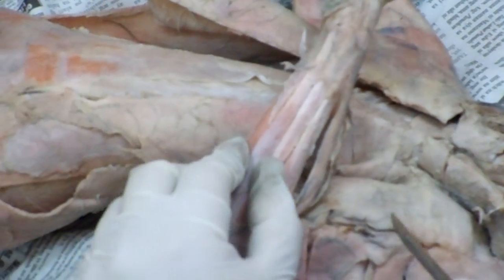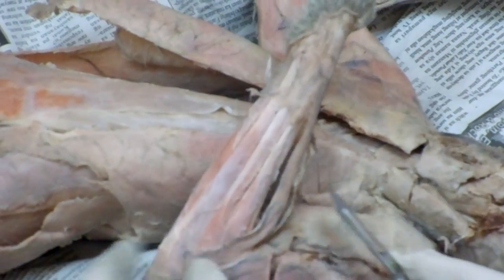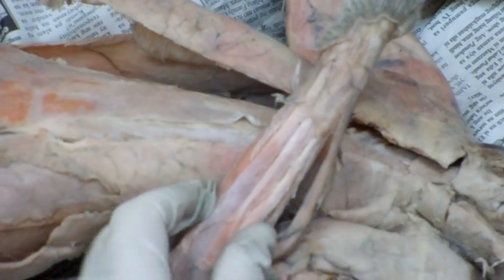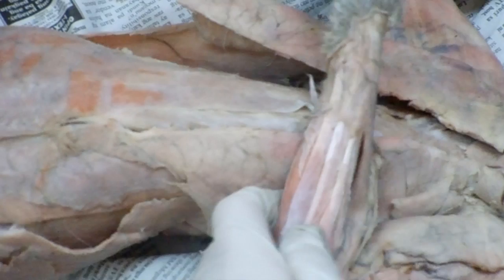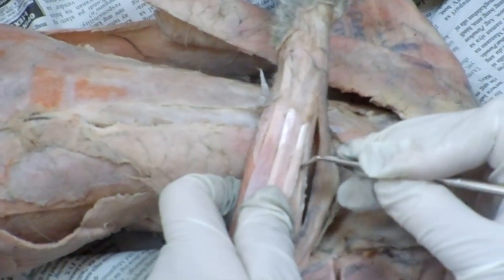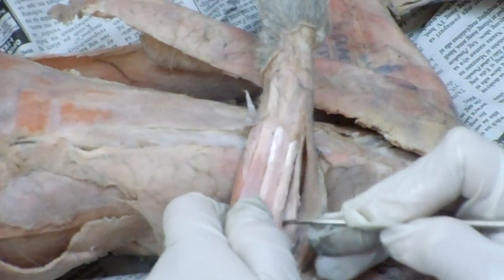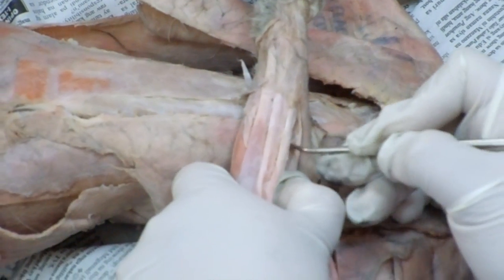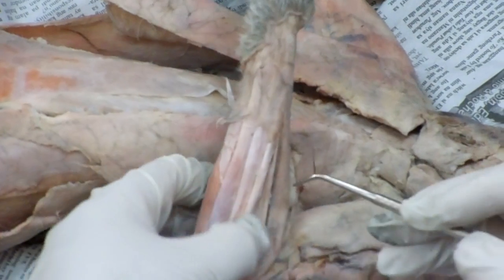Again: extensor carpi ulnaris, extensor digitorum lateralis, extensor digitorum communis, supinator longus or brachioradialis. Next, extensor carpi radialis. This lies under the brachioradialis. It extends into the inner or medial surface of the arm. Turn the forearm to the medial side. This muscle is divided into a long part, longus, seen on the medial surface, and a shorter part, brevis. Origin: humerus near the extensors.